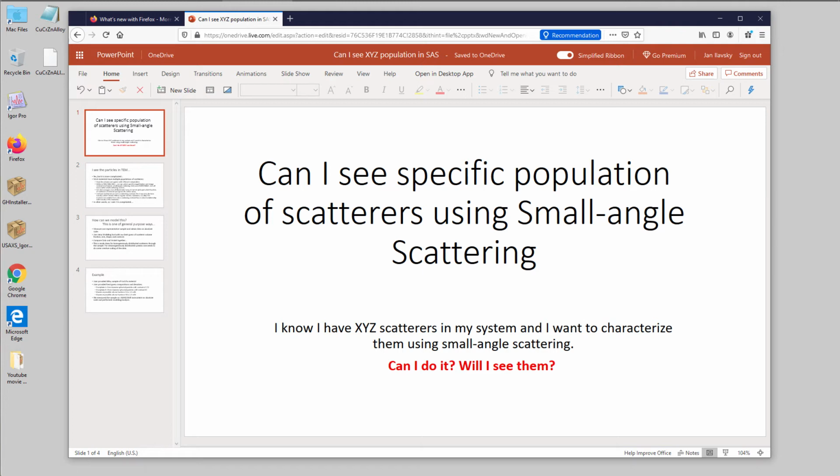Welcome. In this movie, I want to answer a question I keep getting many times, and it's not easy to answer for a generic purpose case. I have a microstructure, I have a sample. Can I see a specific population of scatterers using a small angle scattering instrument?